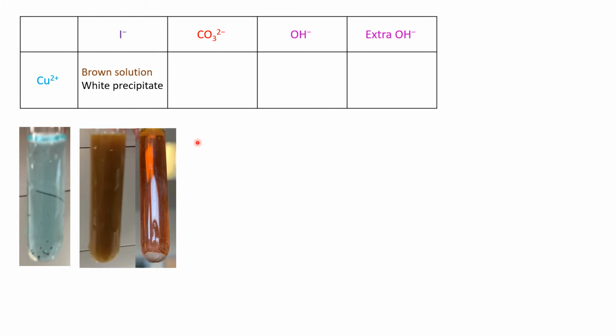What has actually happened is a nice redox reaction. Okay, the copper 2+ gets reduced to copper 1+. Okay, and if it's getting reduced, in other words, it's gained an electron, something else has been oxidized and lost an electron. Well, the other species that's in there is the iodide. If an iodide loses an electron, then it turns to an I atom, 2 of which come together to make an iodine molecule. So the redox reaction is copper 2+ going to copper 1+.